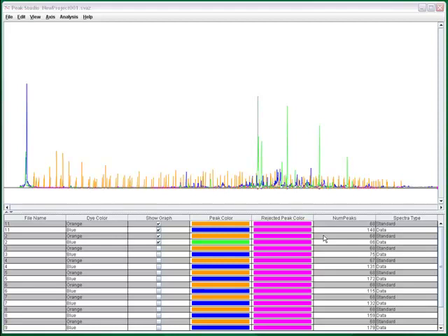Fragment analysis samples that are run on Applied Biosystems genetic analyzers can only be sized if a size standard such as Applied Biosystems GeneScan 1200 Liz is included along with the sample when run on the instrument, so it's important to make sure that any sample files you import to PeakStudio were created from runs with size standards. It is also important to make sure that the peak calling algorithm has been able to correctly identify the peaks in the size standard once they are loaded into an analysis software such as PeakStudio.